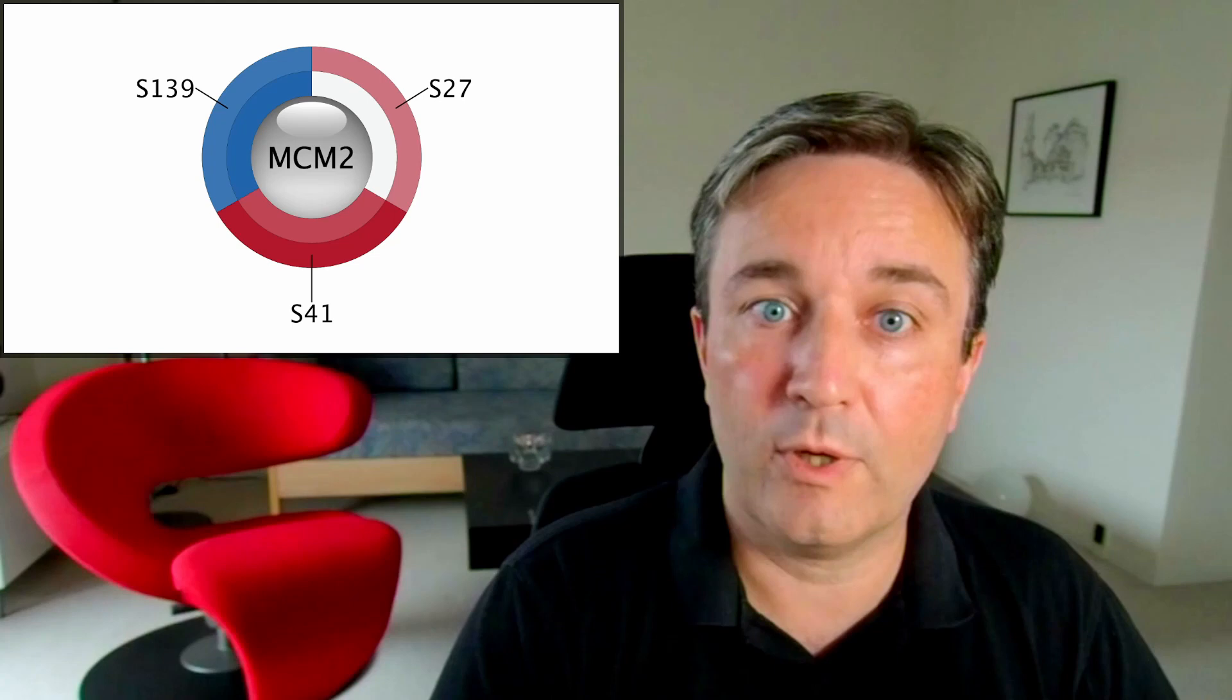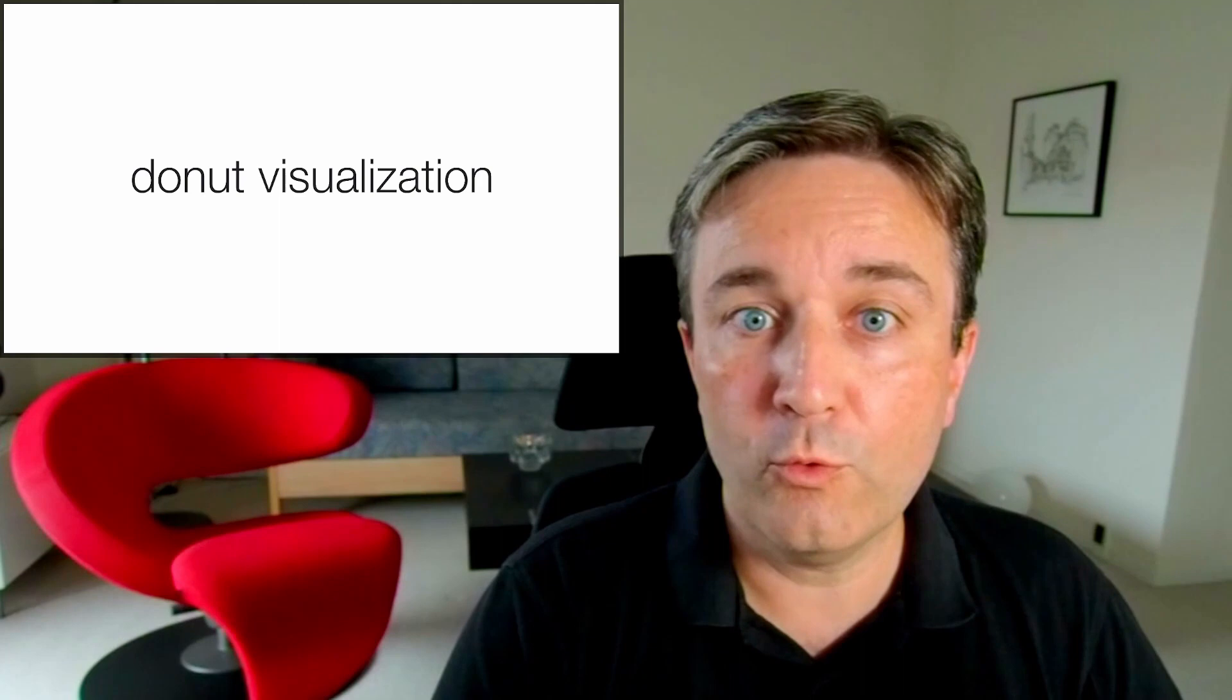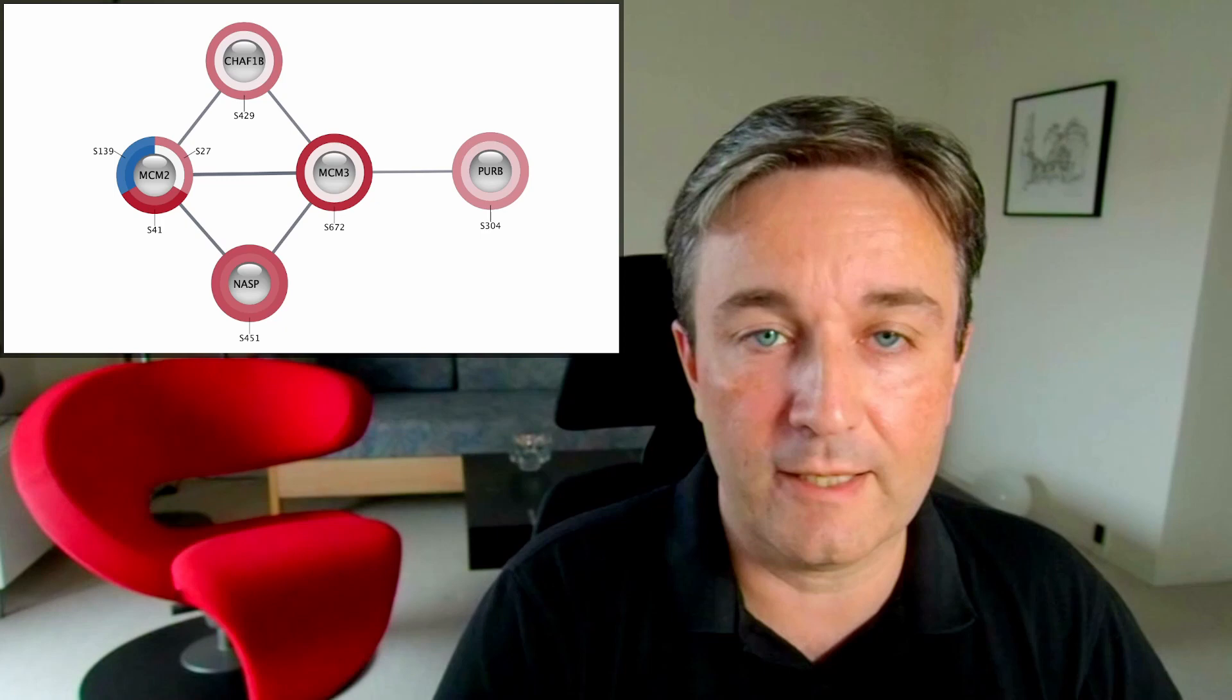You can use this to visualize data on networks in Cytoscape. For small networks, the donut visualization works very well, since it allows you to show all the information at the same time.